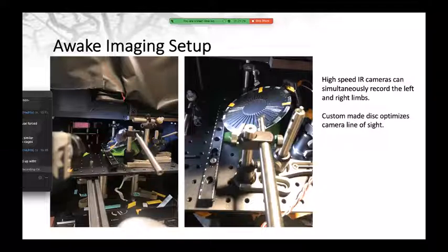Due to the nature of the flying saucer disc and the detection optics box here, it made it more difficult to position this camera on the side. So we weren't getting a full picture of what the left side was doing. Along with Rick Zirkel, another graduate student in the lab, we put together a new flat version of the treadmill. This just pops off that older version of the flying saucer in order to help us image both left and right sides of the mouse.